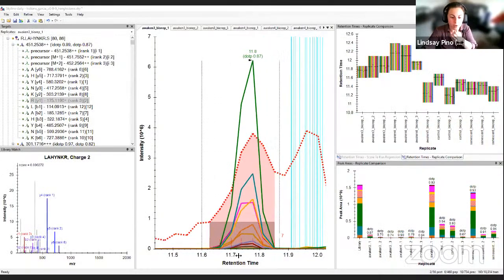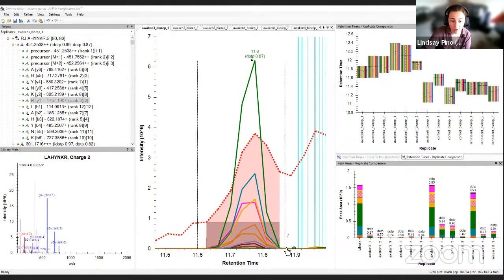Can you see the MS injection time in Skyline? You cannot visualize the injection time, but I'll pull up this results file that I had on hand right here. You can see the points across the peak though, however. So down at the bottom here, next to the retention time, you see there's these red short vertical lines and then this little red number to the right, this little red 7. That's how many points were across this integration here.